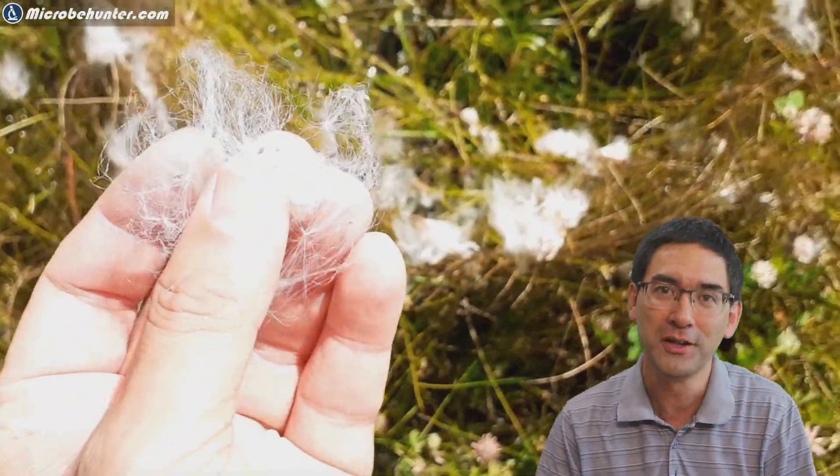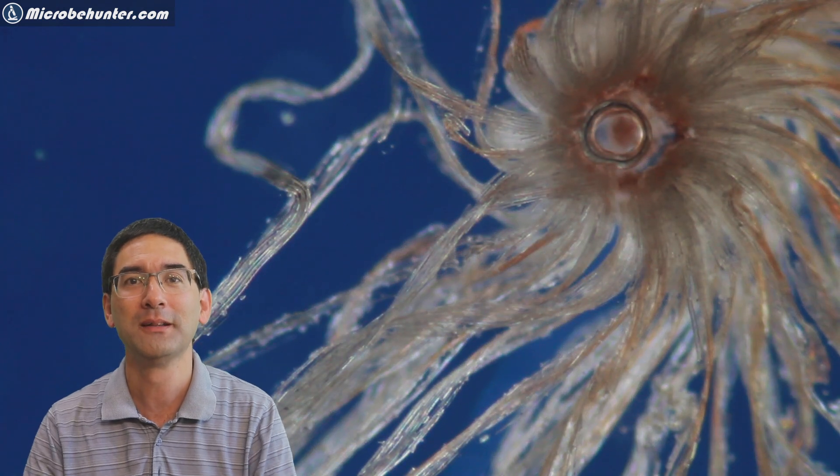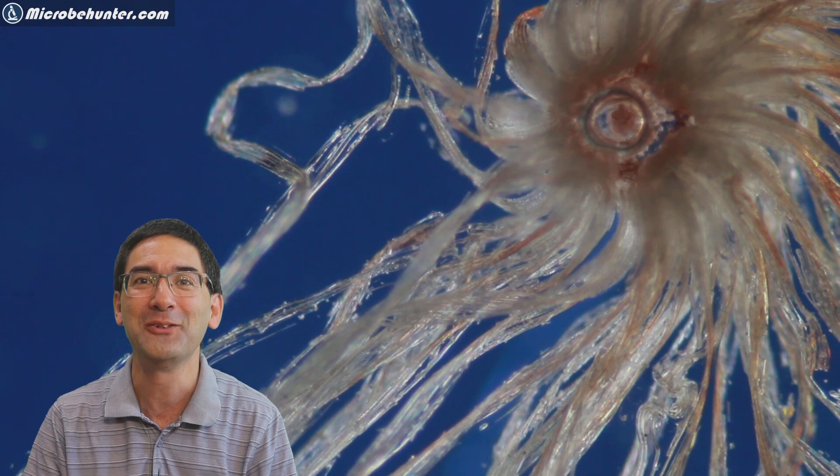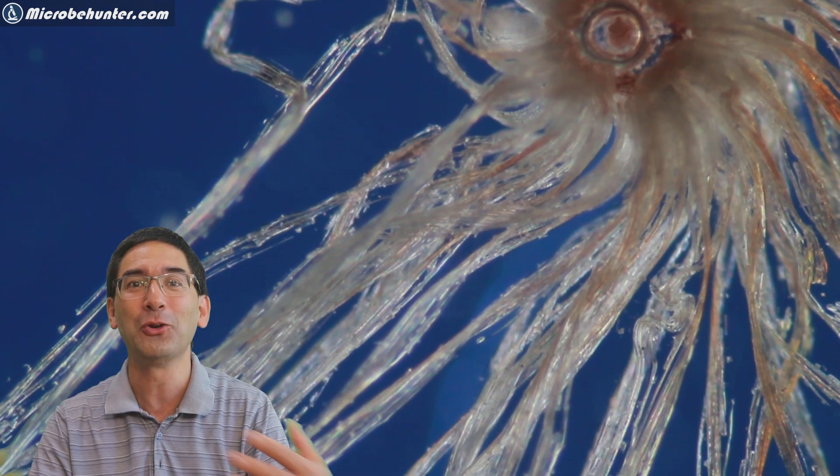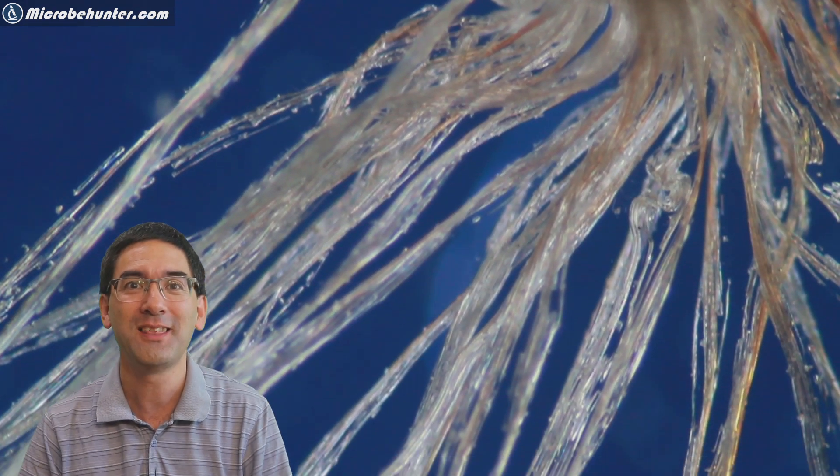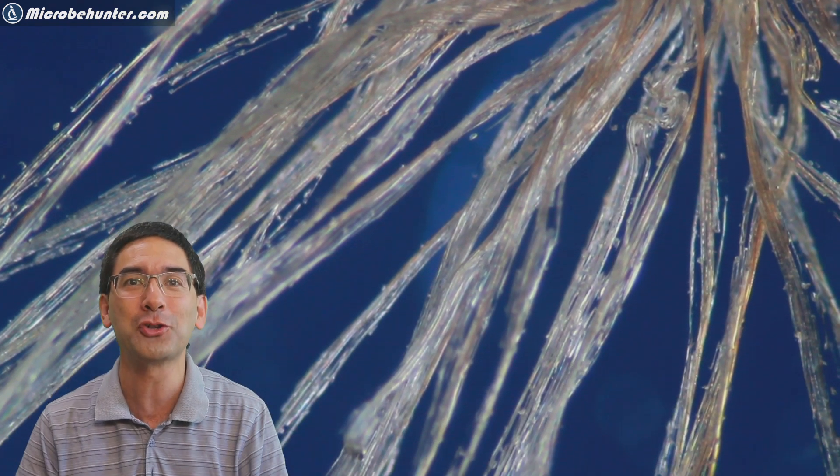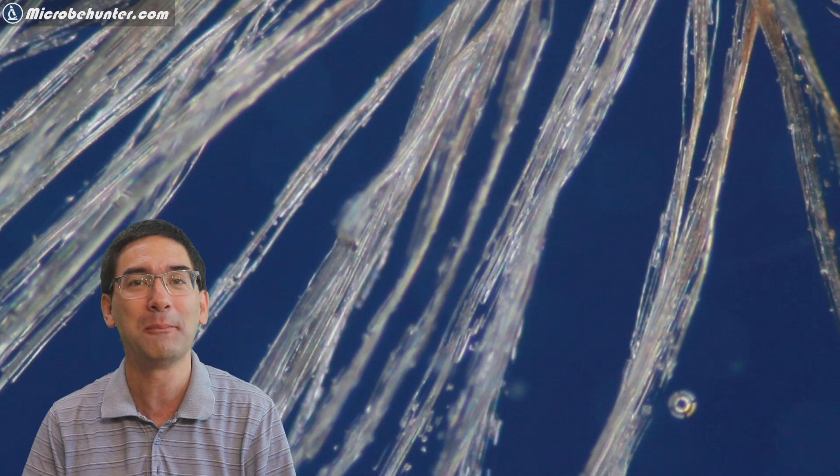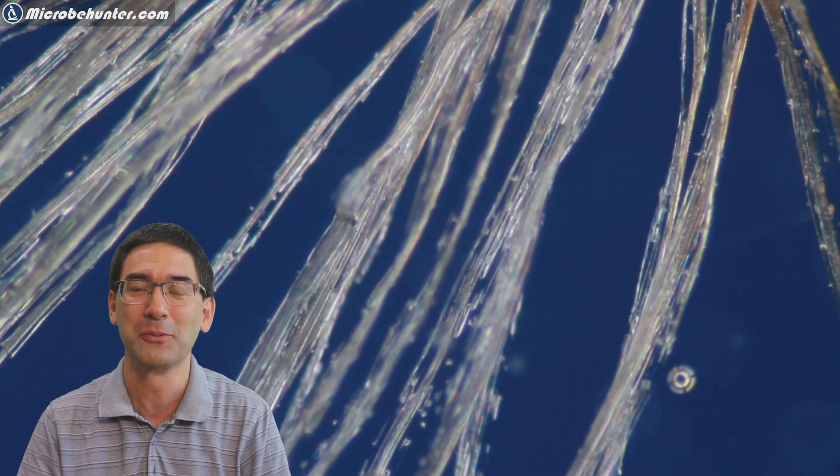So of course I have to put this also under the microscope. But I'm getting a little bit distracted now because the actual purpose of this video is to talk a little bit about the algae and the oxygen production. But that's one of the illnesses of a hobby microscopist is to collect everything and put everything under the microscope that somehow fits on a microscope slide.